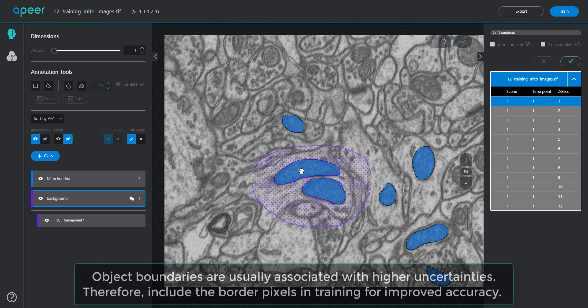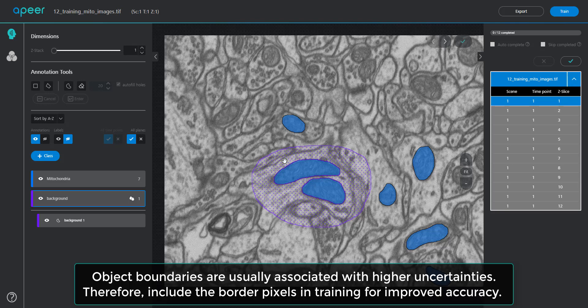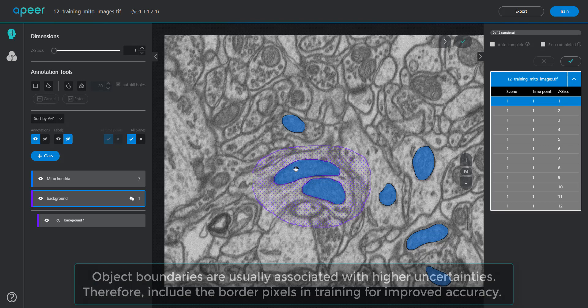In addition, it also defines the boundary between mitochondria and the background, thus ensuring higher accuracy for these regions that are usually associated with higher uncertainties.